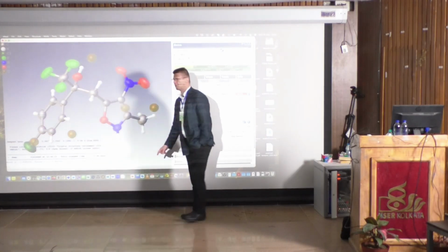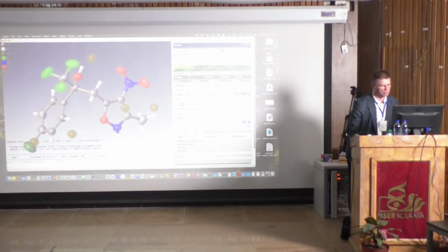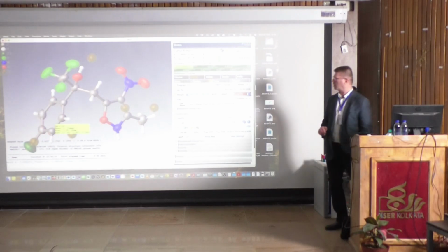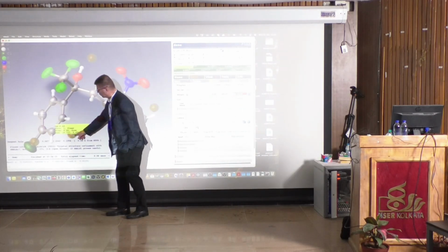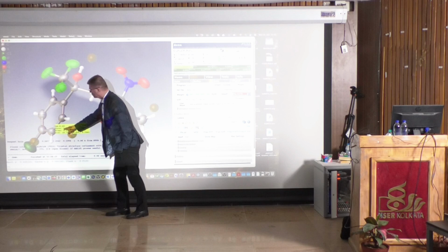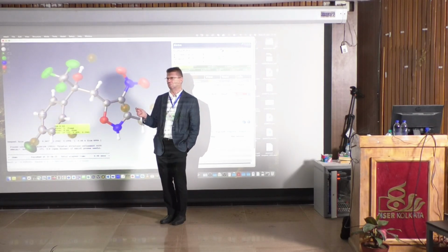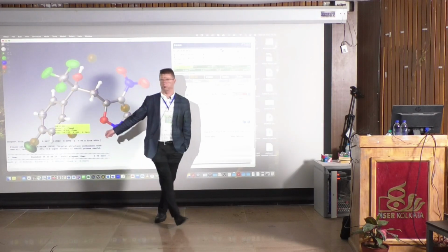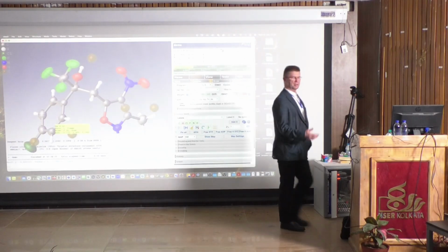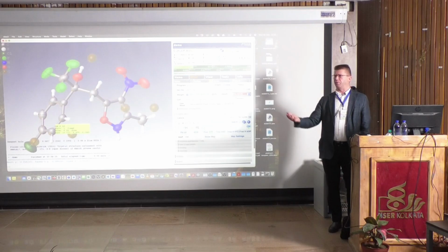And these peaks, we can look at the height of these peaks. I will look, for example, at this one. I will place this one here now. It gives a number, and it says this is Q4, and the height of this peak is 0.13, and hydrogen is 1. So we know that this cannot be anything because it's much less than 1. This is normally how we do the work, but we have a model, so we try to solve them based on the model.